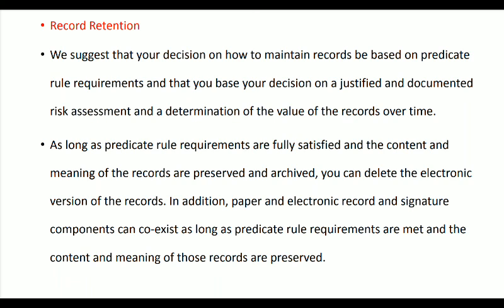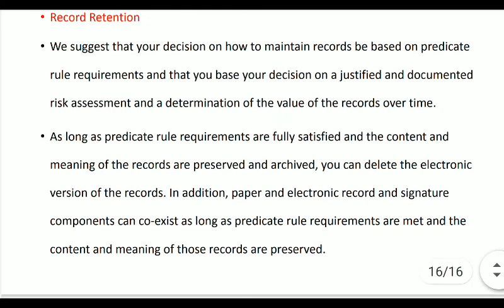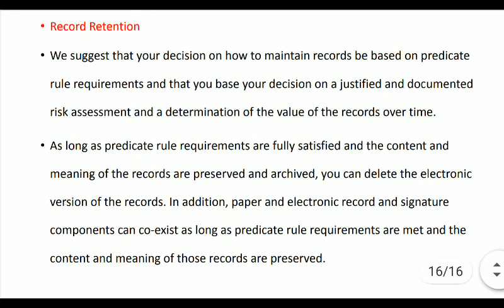It is very important to handle this electronic data and the data should be reproduced during the inspection so that the inspection or you can say the audit by US FDA should be very smooth and it will go through very nicely and there will be no consequences or no extra observations from US FDA. So the use of LIMS and the guidelines given in Good Automated Laboratory Practices ensure the integrity of data, and it will help us to go through the inspections and audits by US FDA very smoothly and successfully.